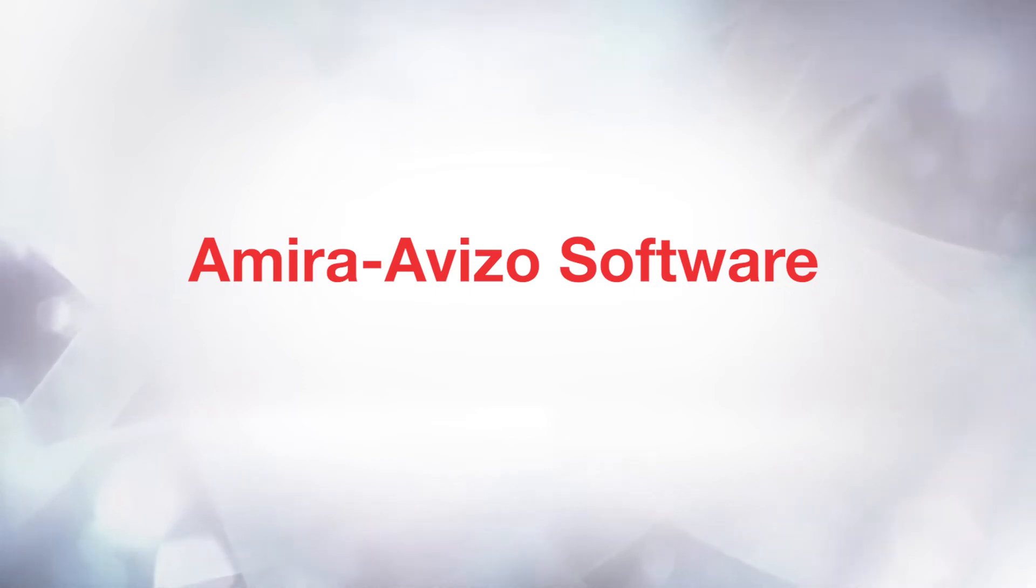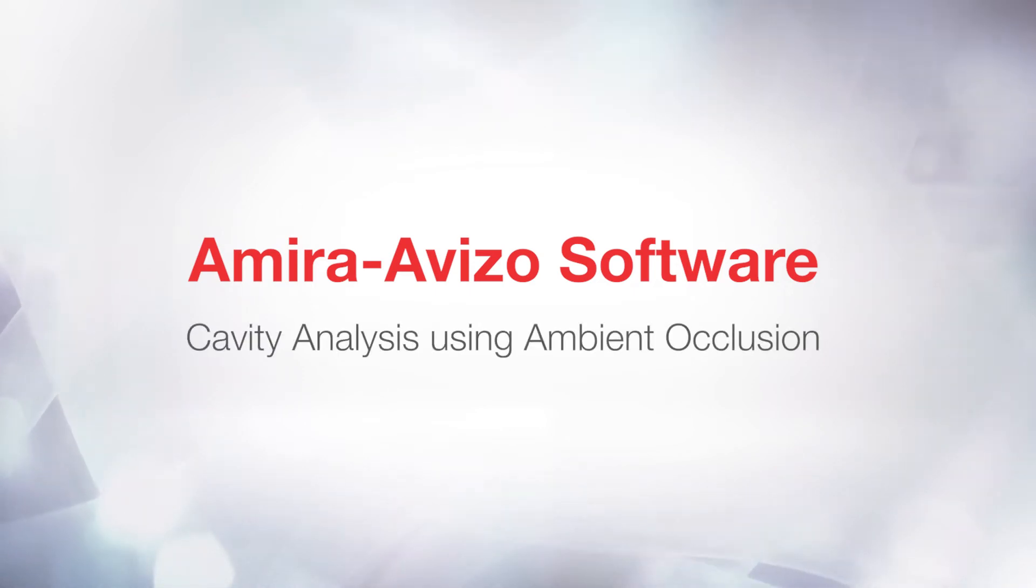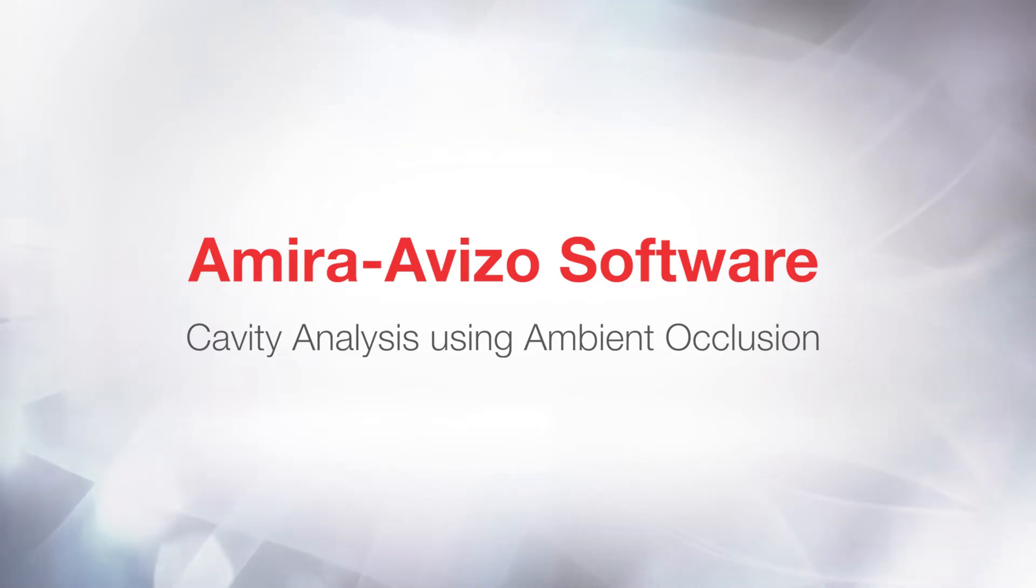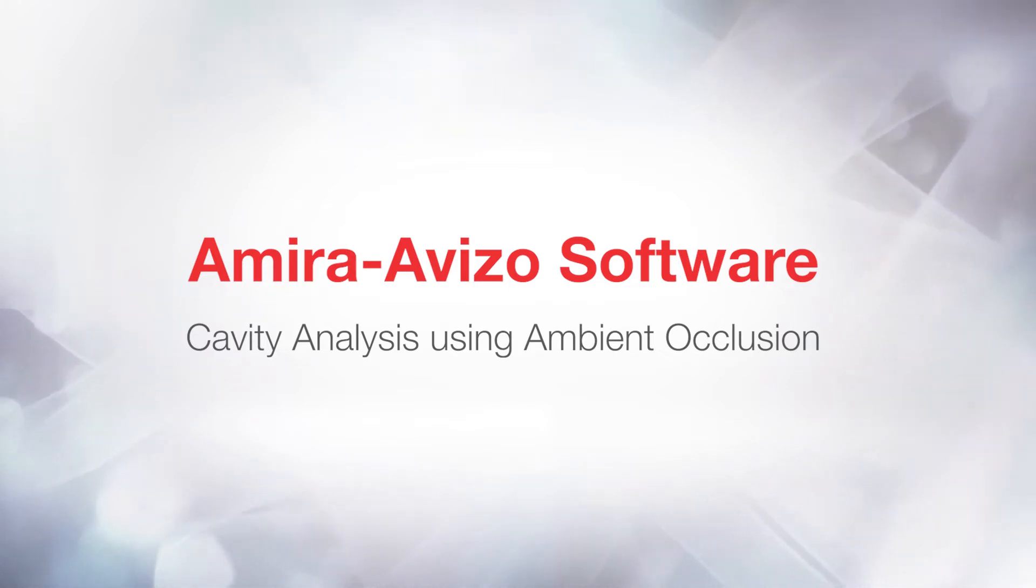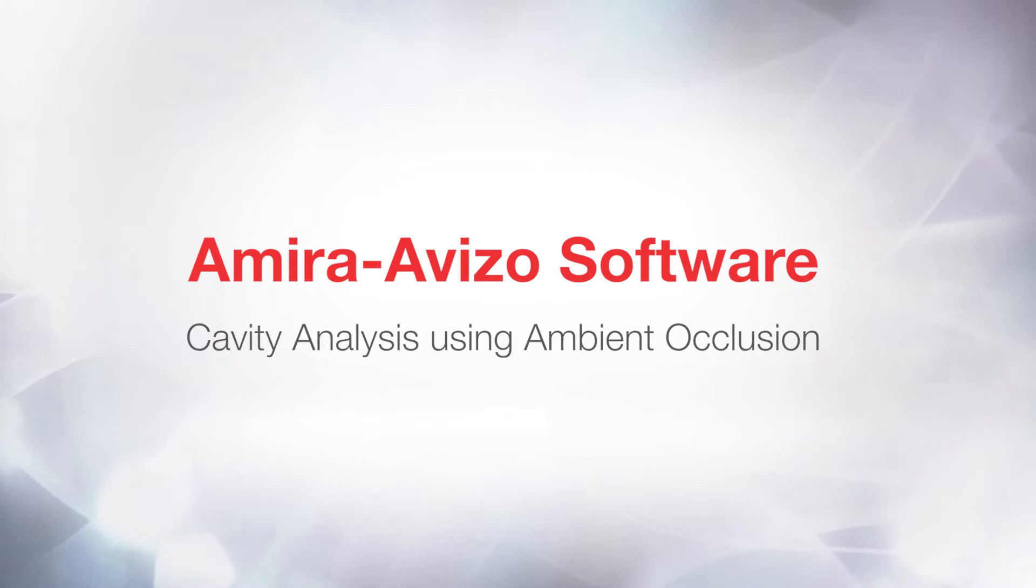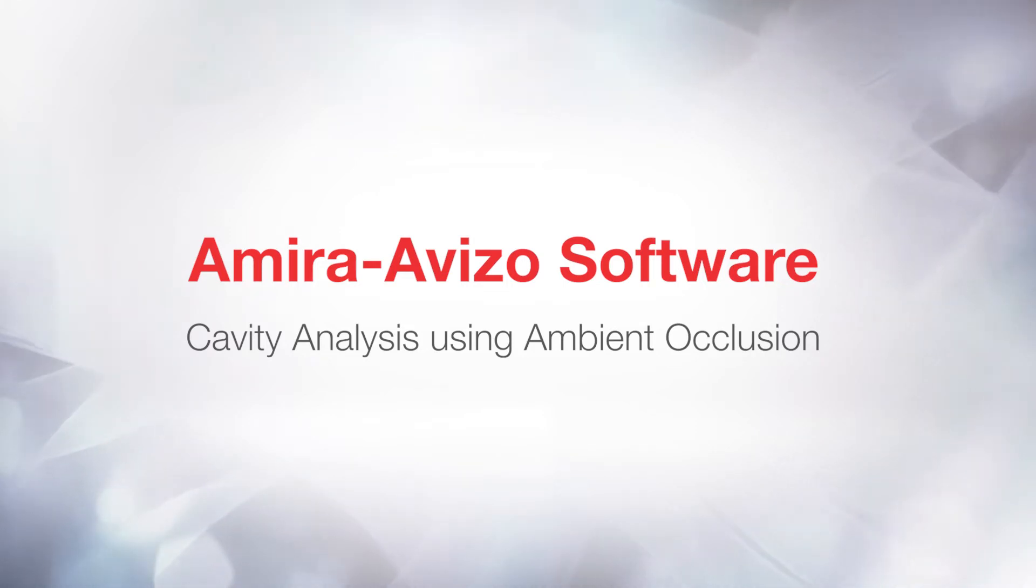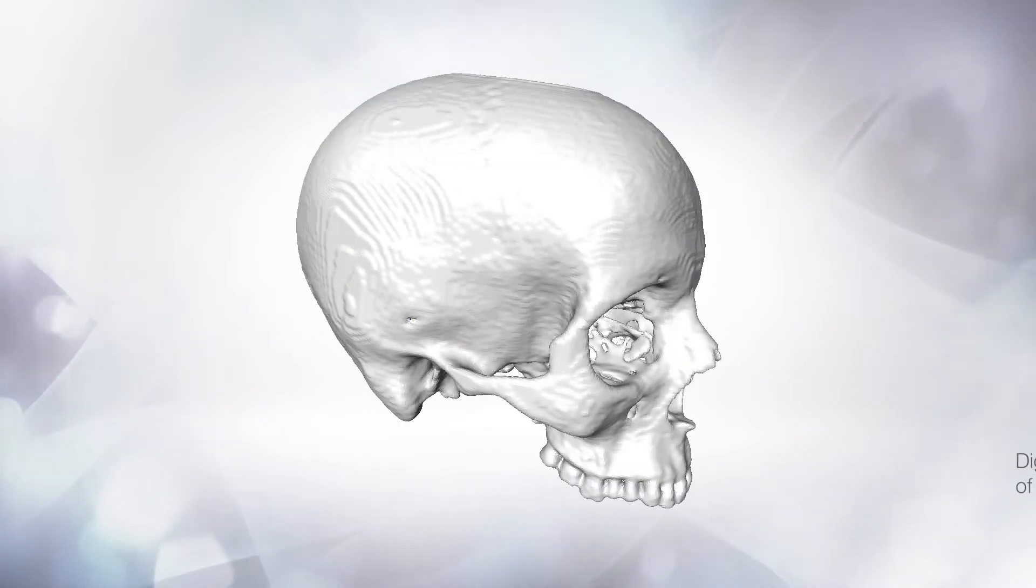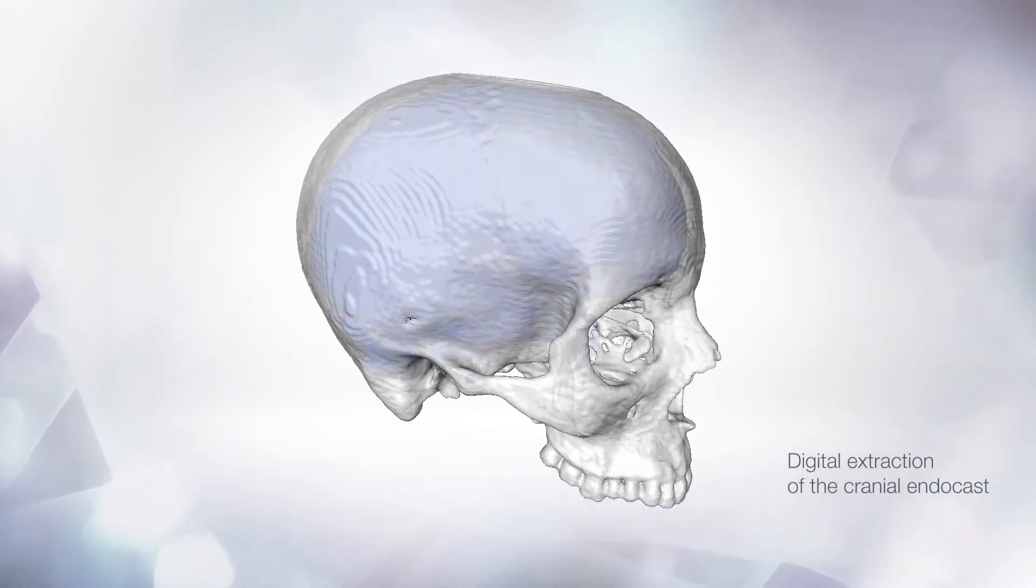Hi, this is Severine from the 3D Applications team. Welcome to this tutorial about cavity analysis using ambient occlusion. The new Compute Ambient Occlusion module enables the segmentation of pores and cavities, which usually cannot be distinguished from the surrounding material by considering the gray values and texture properties of the image. This is a major feature, unlocking segmentation workflows that were not previously possible.